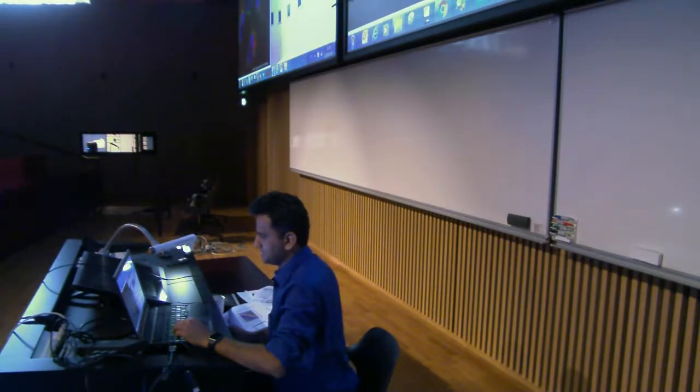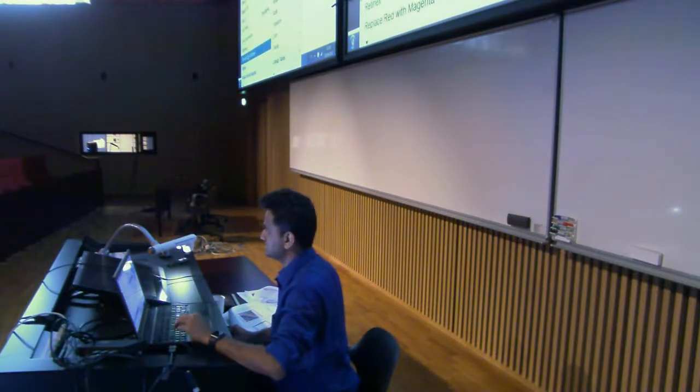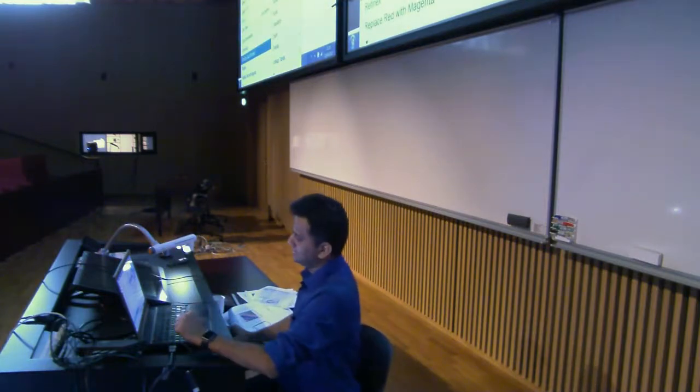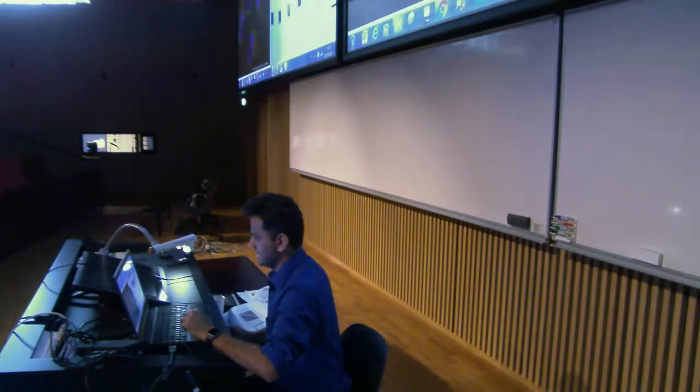one thing I haven't told you is that one can also do the deconvolution, the color deconvolution. That's also possible. You can simulate for color blind people. So maybe some of the journals might want this because they want to have a color image displayed as a color blindness image. So that is also possible.